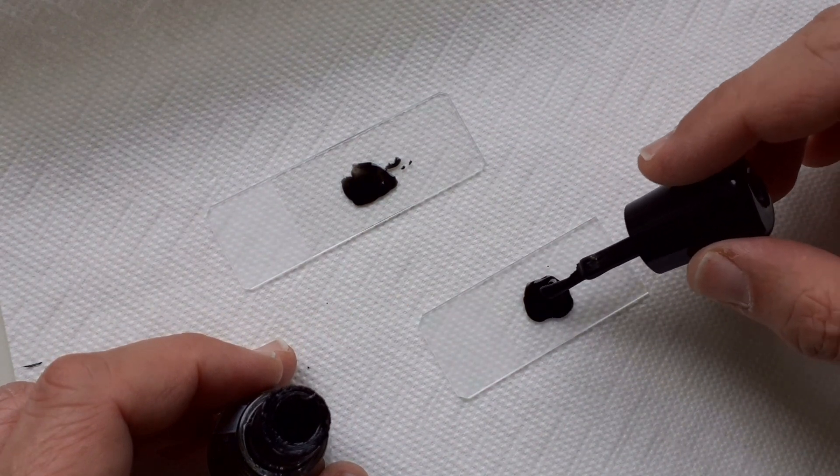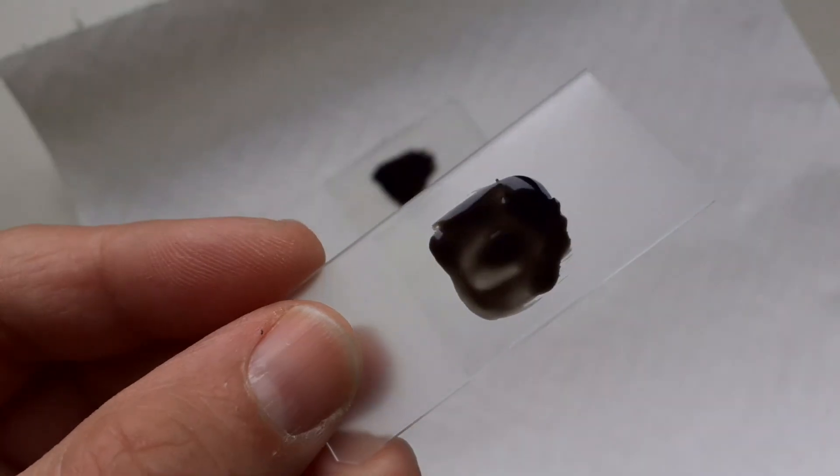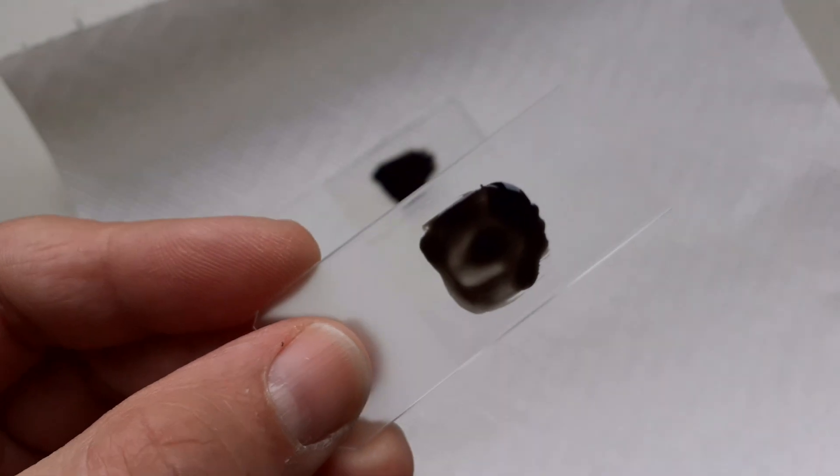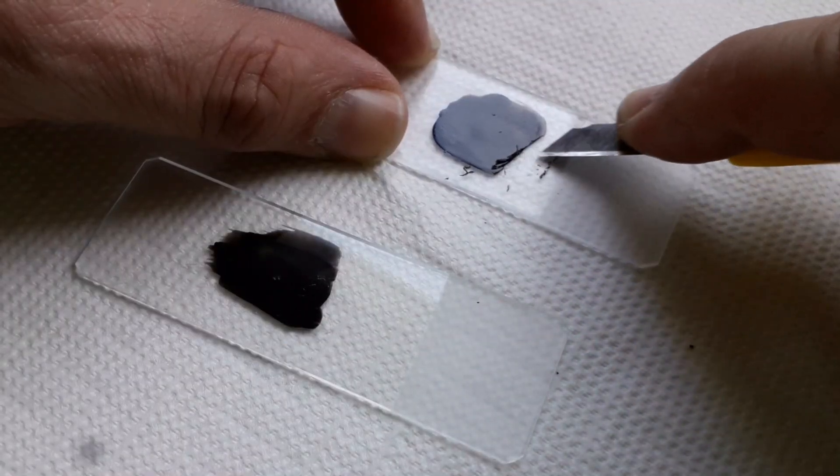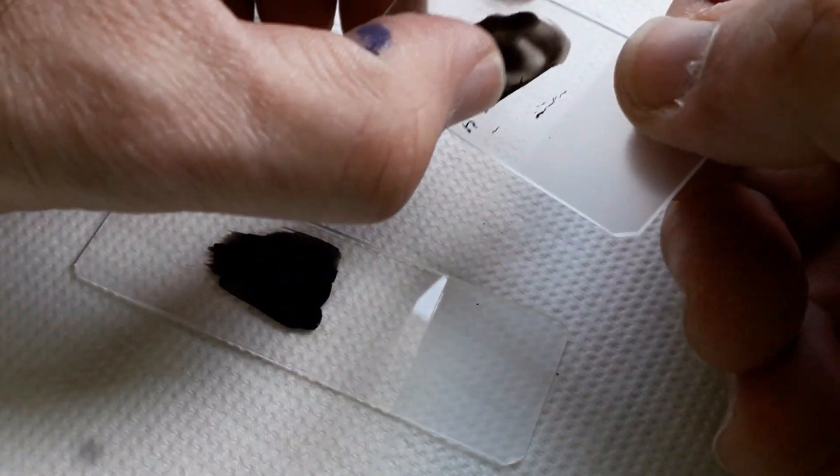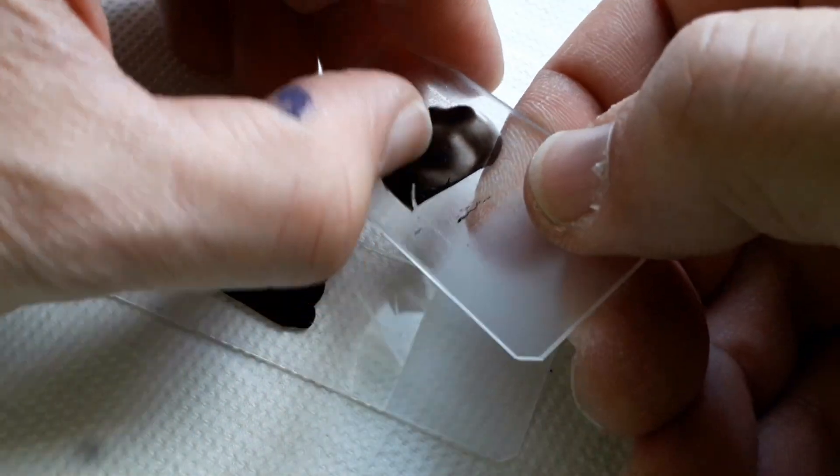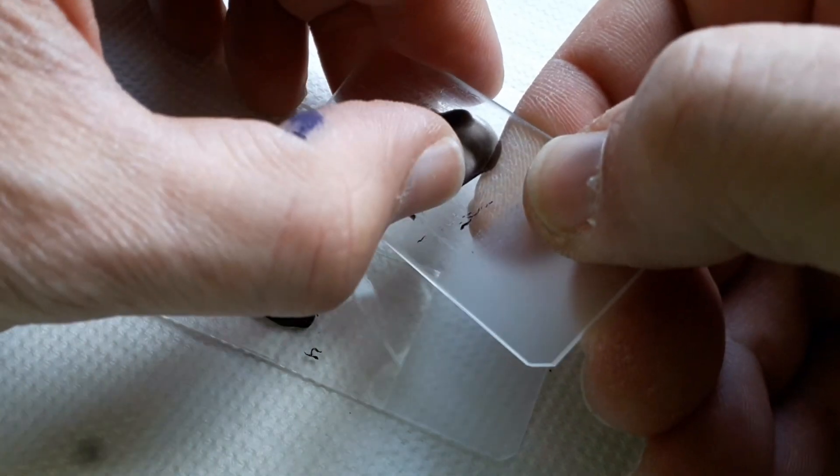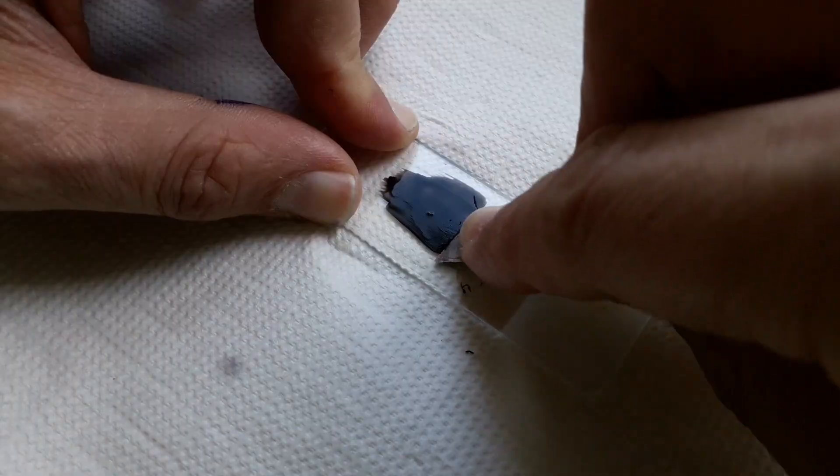And after a short drying time I tried to remove both of them and I wanted to figure out which one is now stronger. So that's the slide that I treated with sandpaper and I now tried to scratch it with my fingernail, and I was able to remove the nail polish a little bit but generally it stuck quite well.